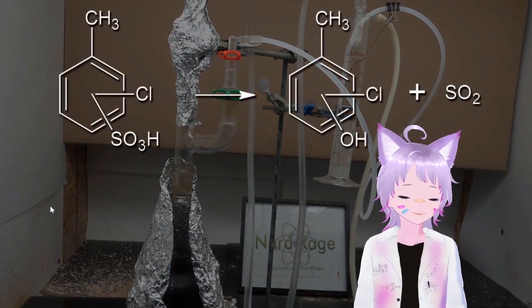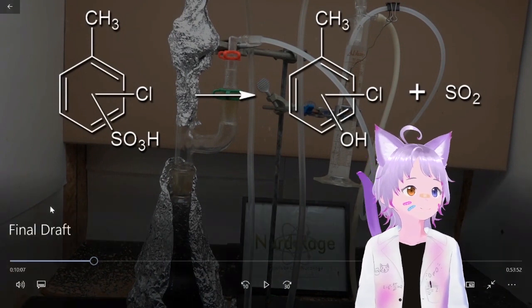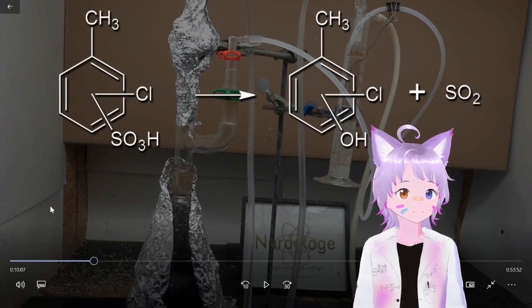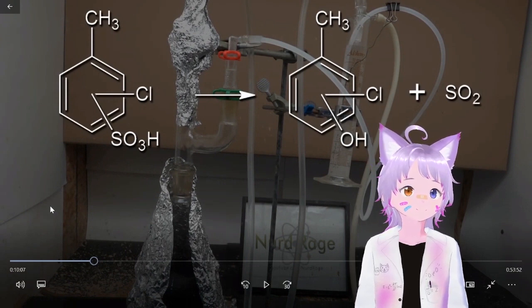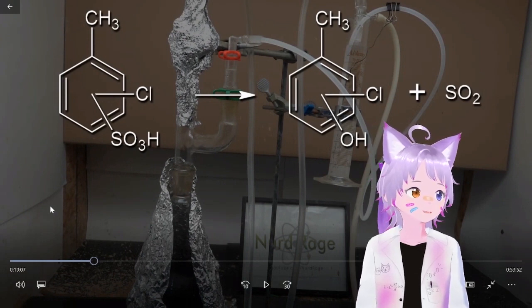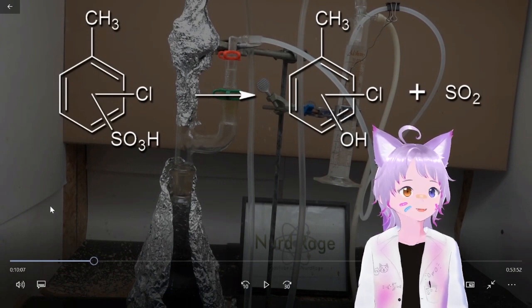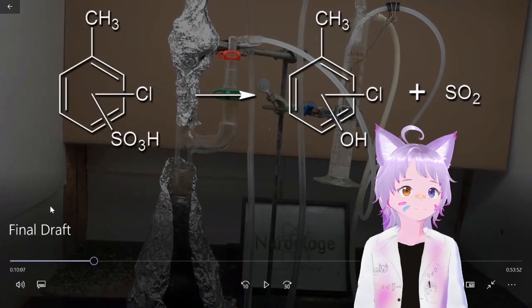Yeah, he's saying he couldn't add all of it at once because it will cook the chlorotoluene and cause it to just start up. Well, we already know why. We're just going to have an addition funnel so we can add initially that much, and then as the reaction progresses, we add the next addition, or even continuously add it. That would take forever, right? If you have an addition funnel, you could just keep adding it and say, hooray, we got it. Might not even reach a 1/10 molar. 1/10 molar equivalent would be our maximum, it should not cross that with our addition rate. But I'm pretty sure it's going to be self-regulating, so that's not a big problem.